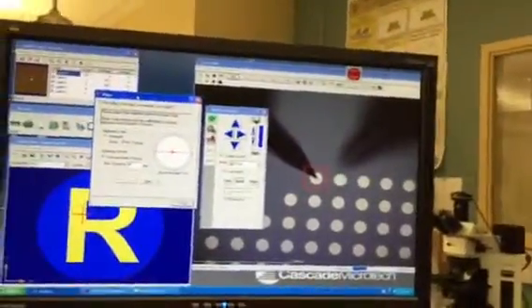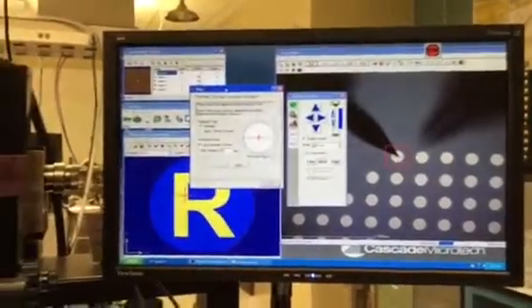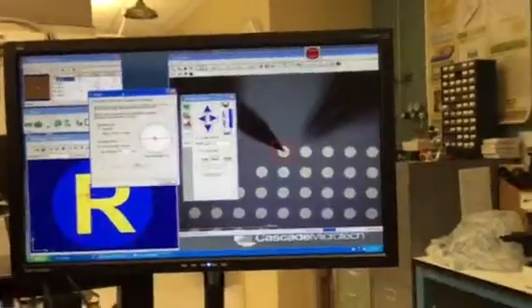I guess we didn't get trimmers that only you can operate. We don't know how to do that. The alignment mark? Do you know how to do it?